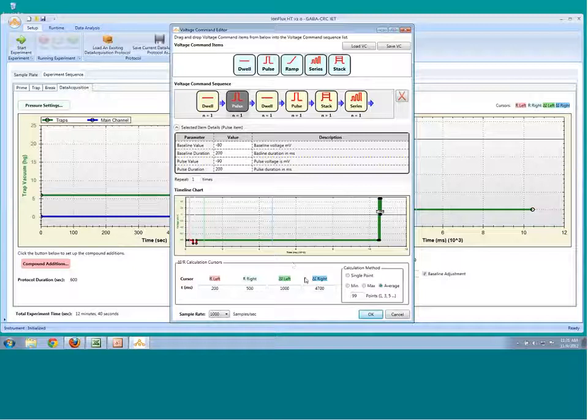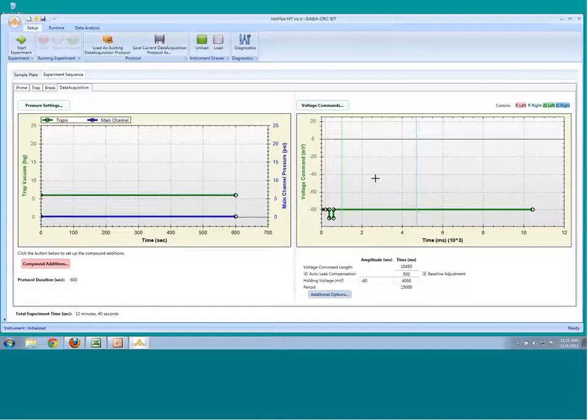So we have our evoked current and can make a measurement in real time and build a real-time IT plot while the experiment's running. So again, we could be looking at both our sweeps as well as an accumulation of what the current amplitudes look like in real time. And then we would also be defining our sampling rate here, and our max sampling rate on the IonFlux systems is 20 kilohertz. So our voltage protocol would be running throughout the experiment.